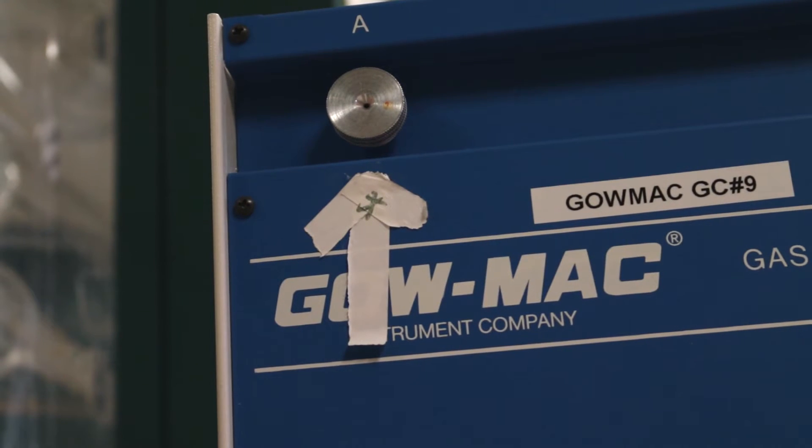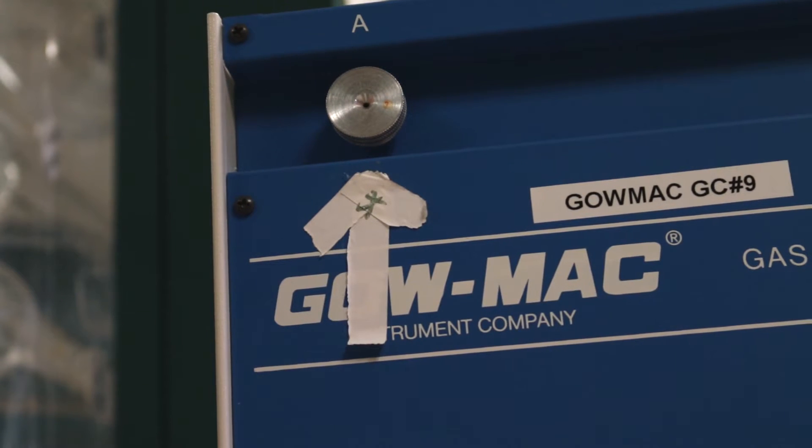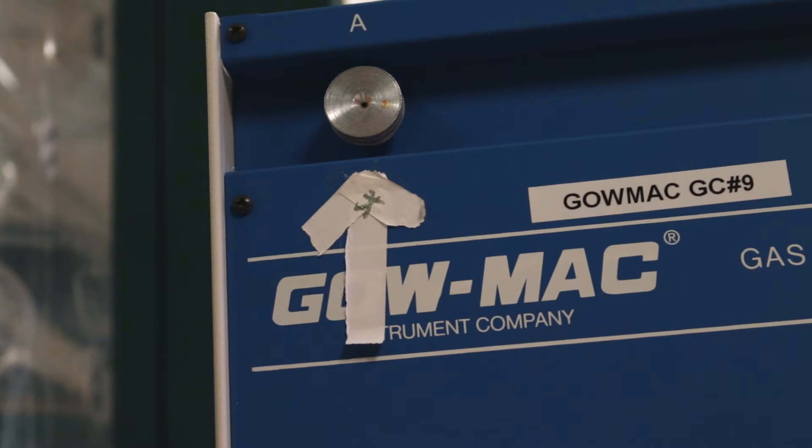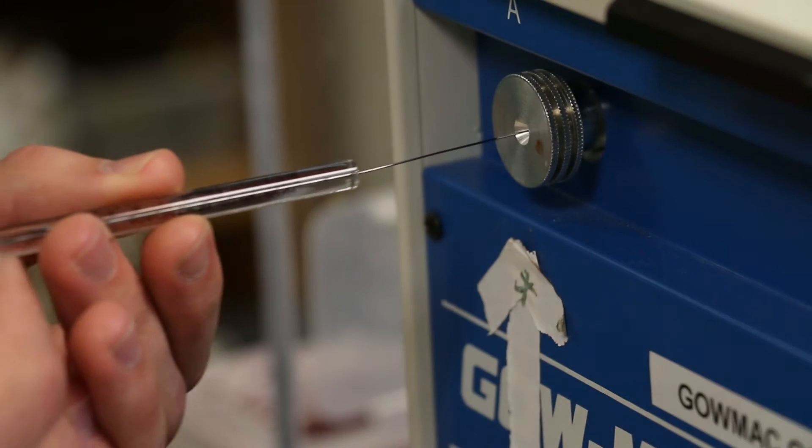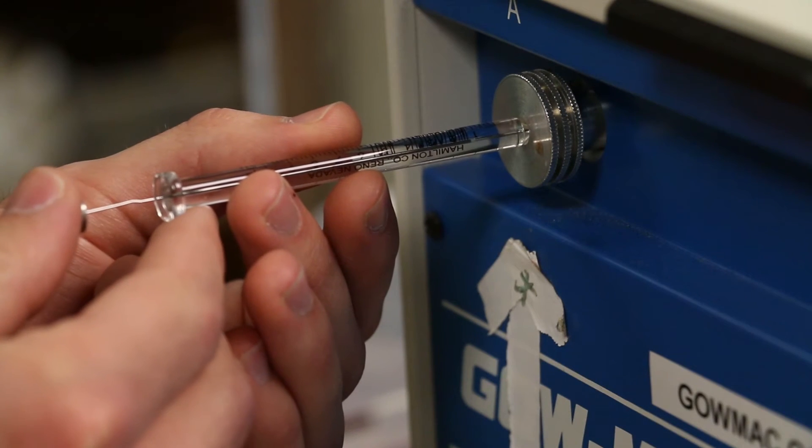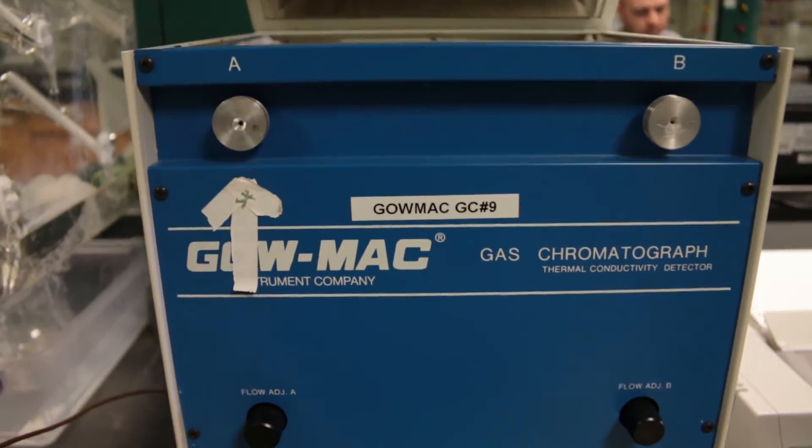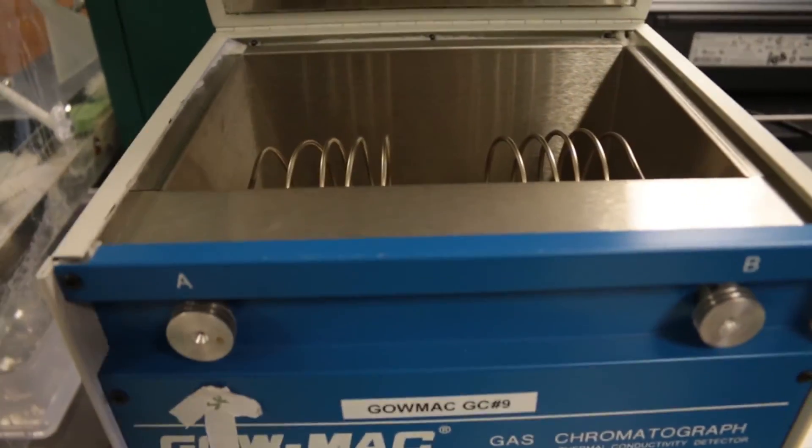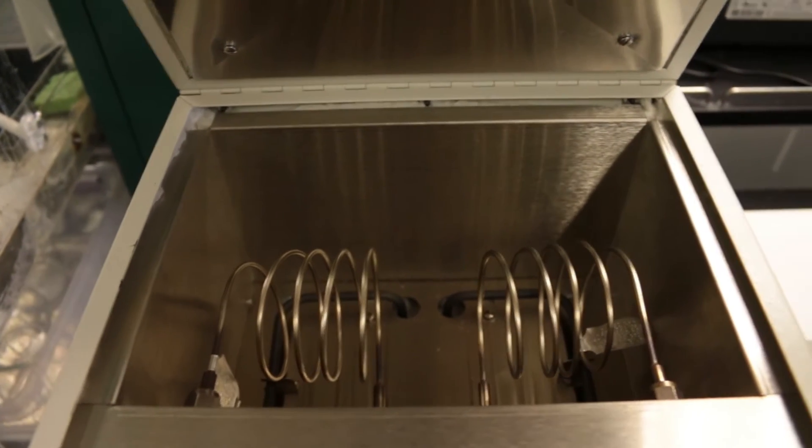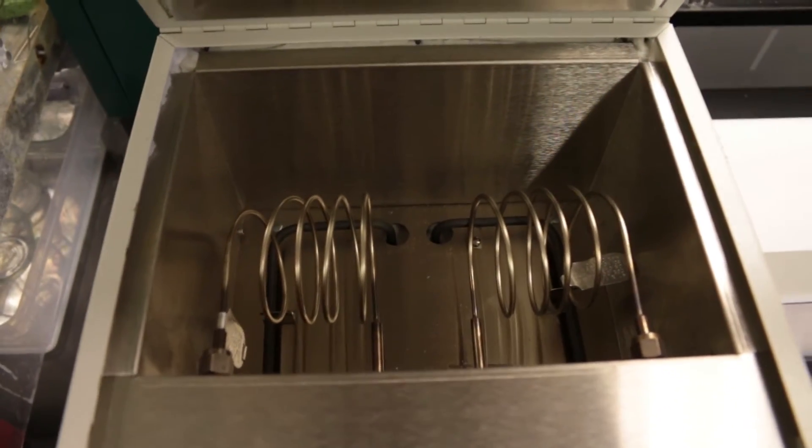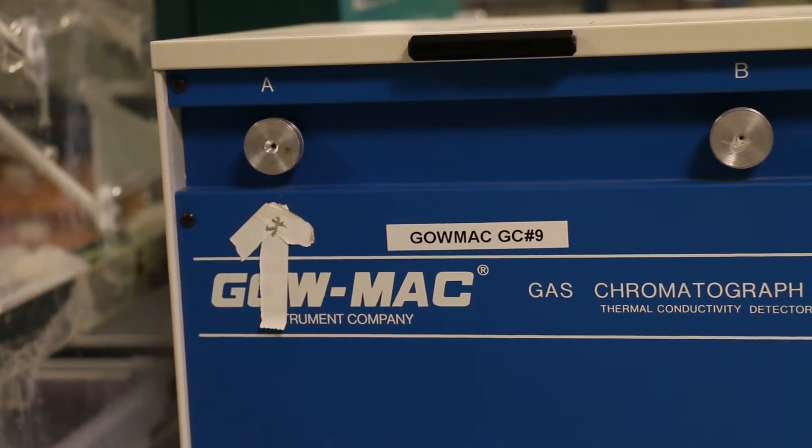The injection port contains a rubber septum that the syringe needle must pierce to get onto the column. So expect resistance as you push the needle through the septum during an injection. Each GC has two injection ports and two columns containing different stationary phases. You should inject in the port indicated with an arrow on the machine.